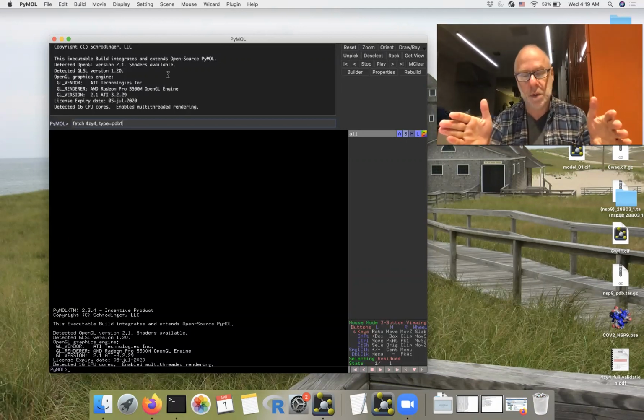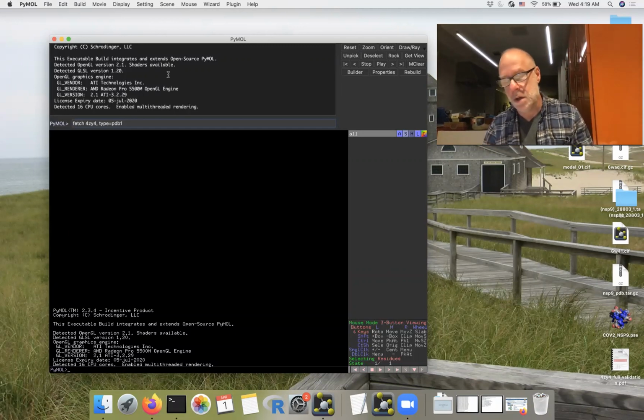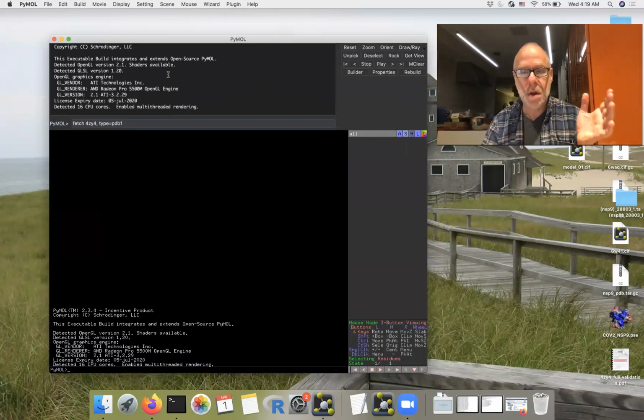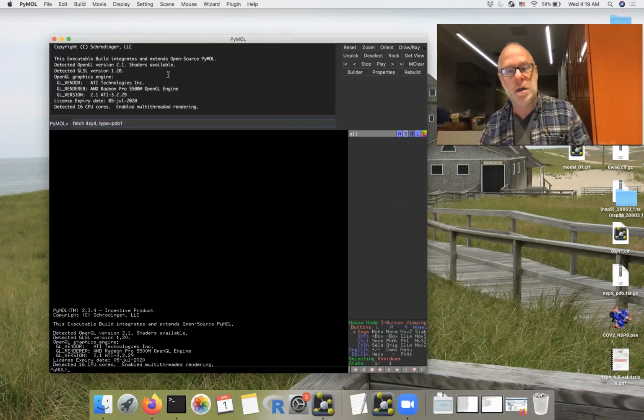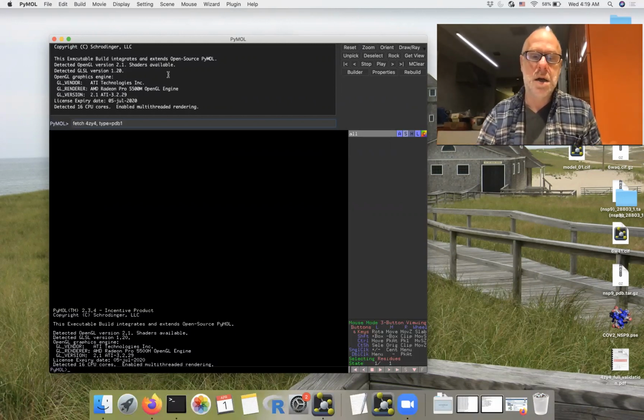And so they were restricted to 80 character lines, which for a PDB atom, with atom, residue number, atom number, residue type, atom name, X, Y, and Z, some other information about the atom position, it's tough to fit into 80 characters. So stuff kind of bumps up against each other. Where you don't have spaces between some of those elements, you just have to measure where they are in the column numbers. The mmCIF format is much better and is easier to work with on a computer by far.